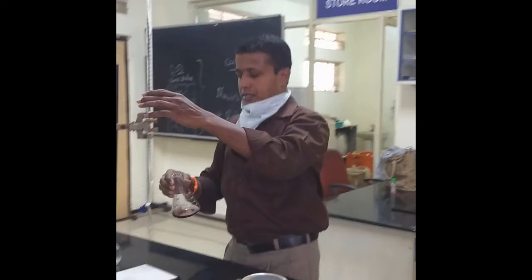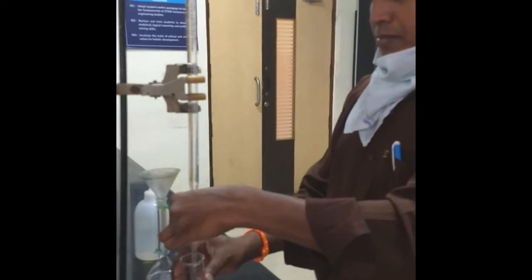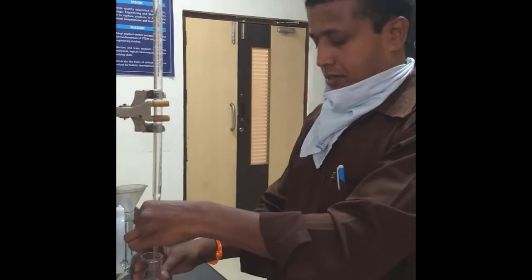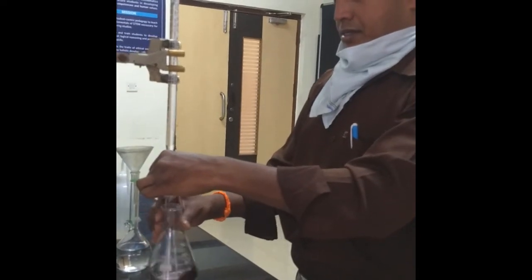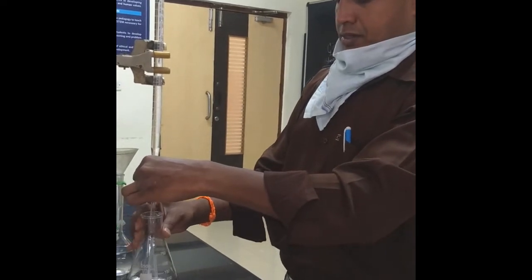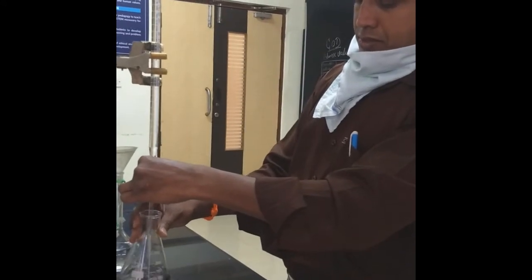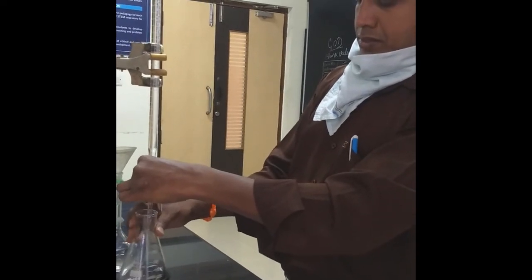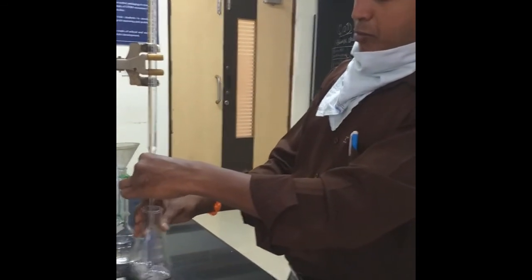Now it is to be titrated with the standard solution taken in this burette, till the color changes from wine red to clear blue. Slowly I have to add. Whenever it is reaching near to the end point, add drop-wise slowly.